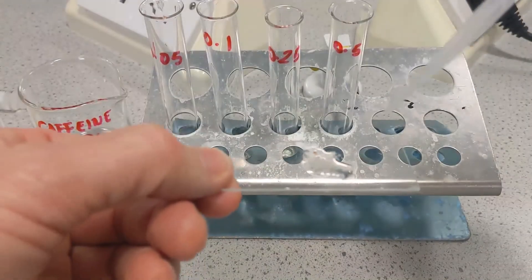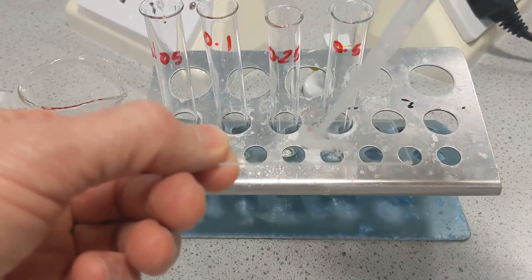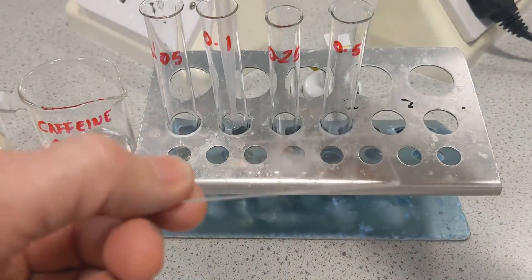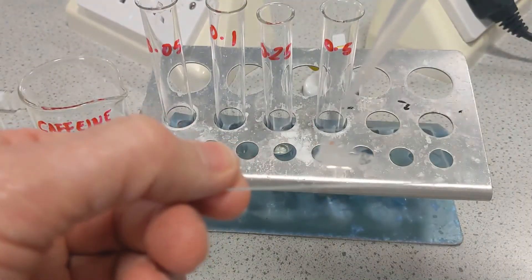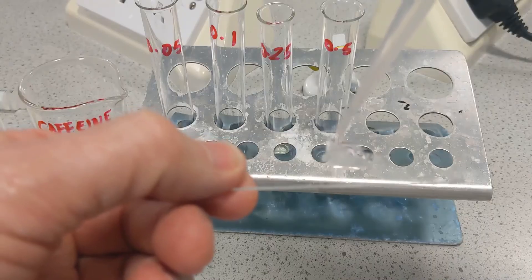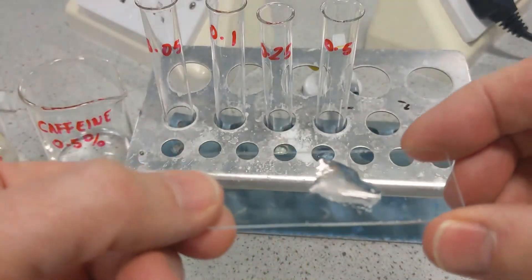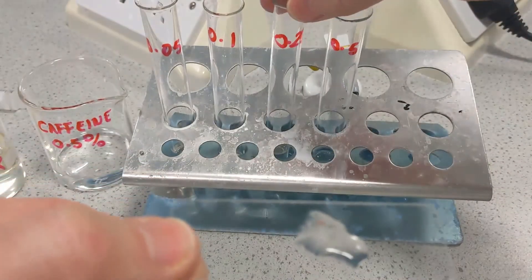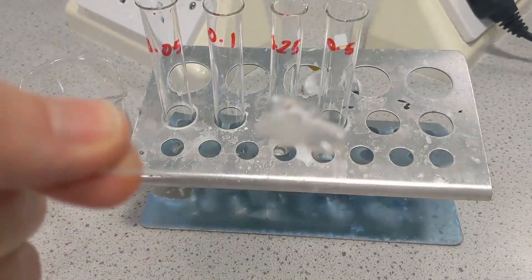We can now take off the 0.05% solution, aspirate it off to waste, and then put a few drops of the 0.1% onto the Daphnia — 1, 2, 3 drops. Then we can go and measure the heart rate again. Repeat that again for the 0.25% and the 0.5%, and then plot a graph of your results.